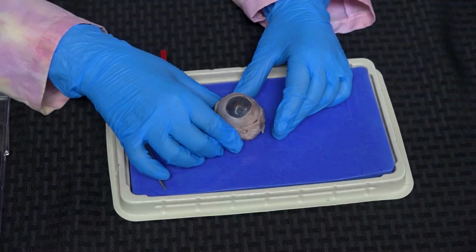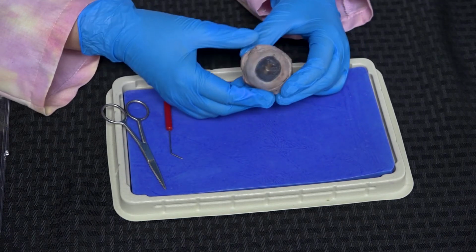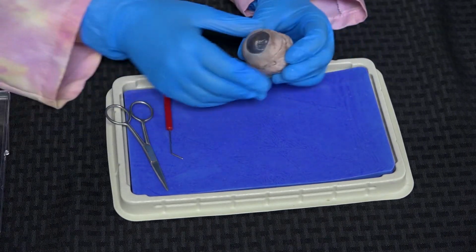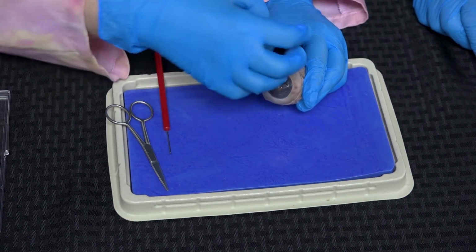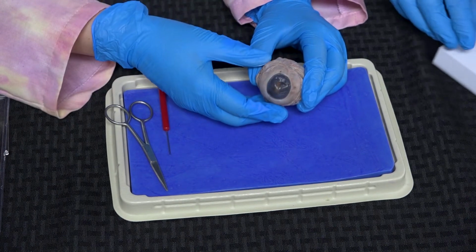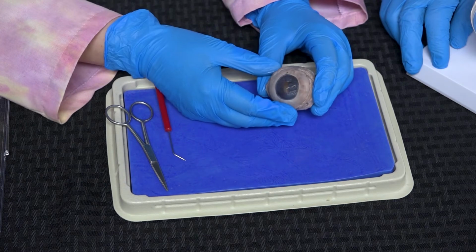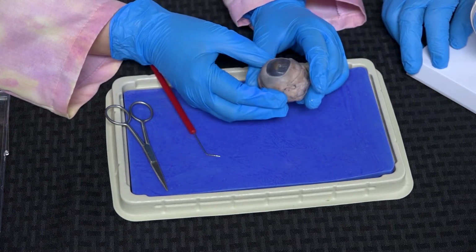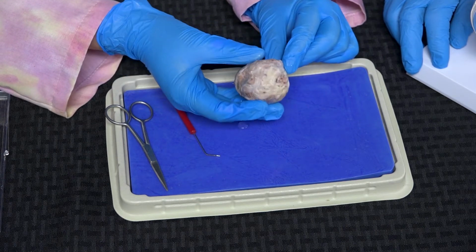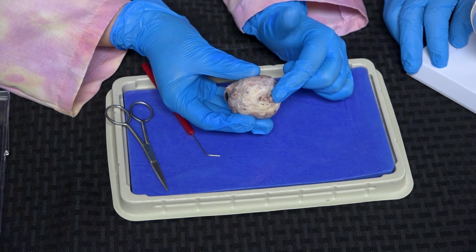All right, I got a cow eye right here, just ready for us. Okay. All right, so here is a real cow eye. And it looks somewhat like the model, but there are some differences. So, for example, the cornea, that kind of clear protective cup on the outside of your eyeball, it doesn't look clear in this one because of the preservative used, but it is there. You can see this cow had brown eyes, and let's look at the back, you can actually see the optic nerve. That's where the signal is going to travel to the brain.